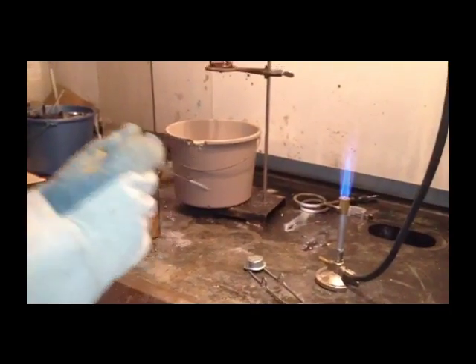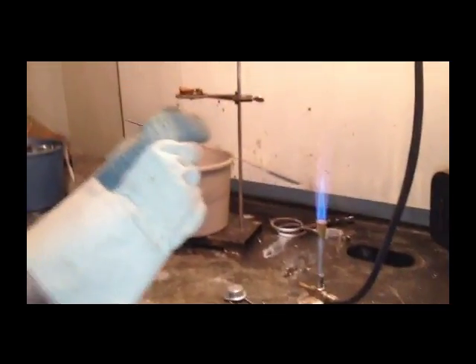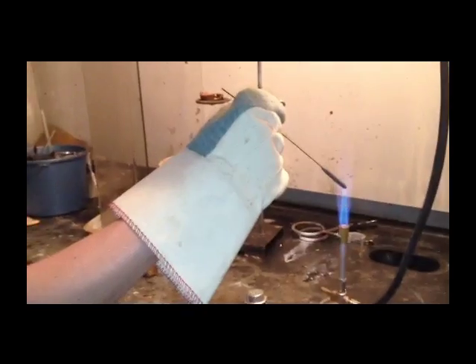Now here's the full demo of the thermite reaction. Here, a magnesium starter is ignited in a Bunsen burner flame. The igniter is placed into the cup of thermite. Once the reaction starts, the fume hood is closed and the fan is turned on.